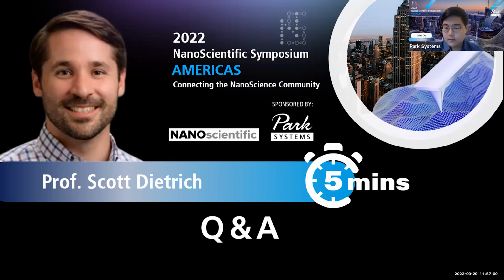All right, I do see one question. I will read it off for you, Professor. What was the pressure to erase the patterns? Was it low? The pressure of the vacuum to erase patterns? It was a roughing pump, so 30 millitorr, nothing ultra high vacuum. That could have an effect. We tried to remove most of the oxygen from the environment, but it wasn't anything in ultra high vacuum.